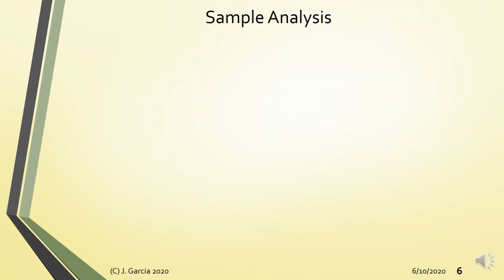Okay. So basically, for IR spectroscopy, there are two ways to analyze your sample. It can either be via transmission or via reflectance. So transmittance measurement or reflectance measurement. All right. So this uses different sampling accessories. So yung pagpili ng appropriate sampling accessory would depend on the sample type.